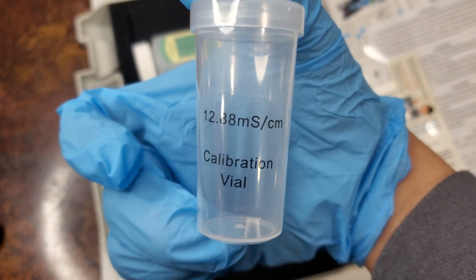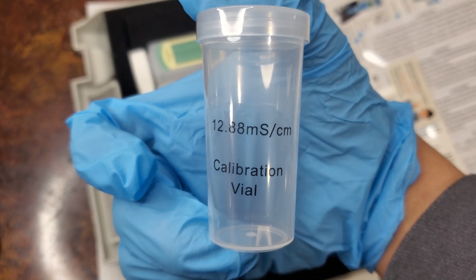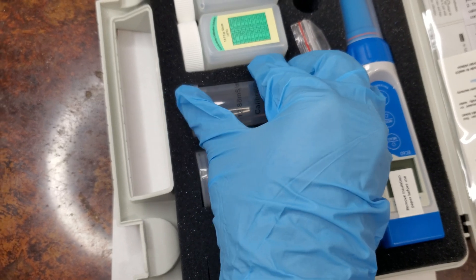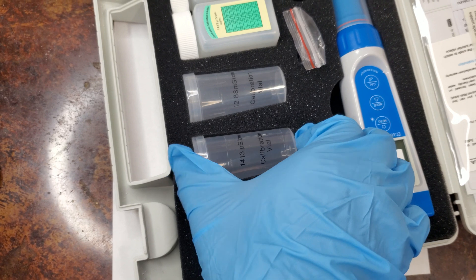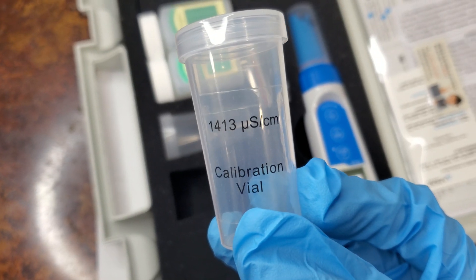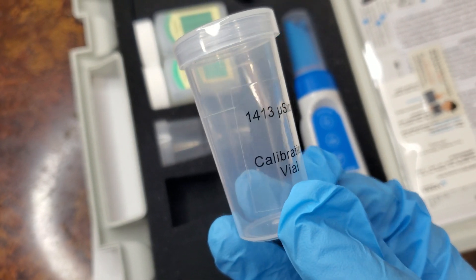Fill the vials or bottles with each type of solution. After 5 to 10 uses, the calibration liquids must be replaced.